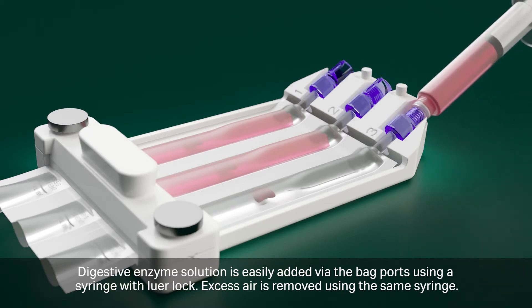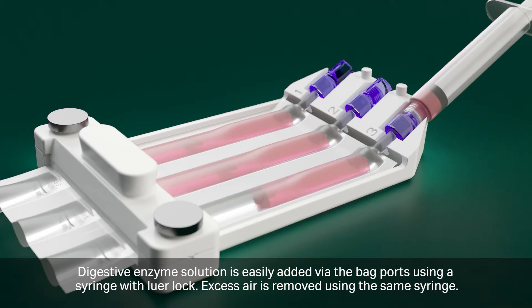Digestive enzyme solution is easily added via the bag ports using a syringe with Luer-lock. Excess air is removed using the same syringe.